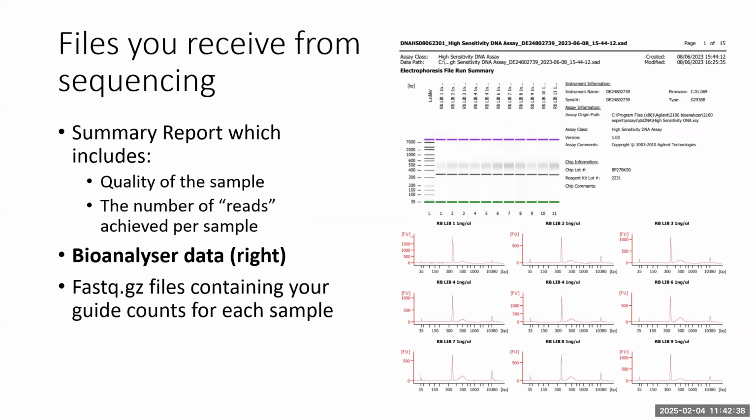The second PCR, do gel extraction. That was a real headache because, as you probably know, gel extractions are pretty terrible. I think, again, we ended up with a bead system doing that. The QIAGEN ones were horrible. And we would get like 10, 20% recovery, and the quality was really poor. So yeah, that's also fairly key. It's pretty depressing when you do the second step and you use a whole ton of your first PCR and you get a nice band for the second PCR, and then you gel purify it and you get nothing back.